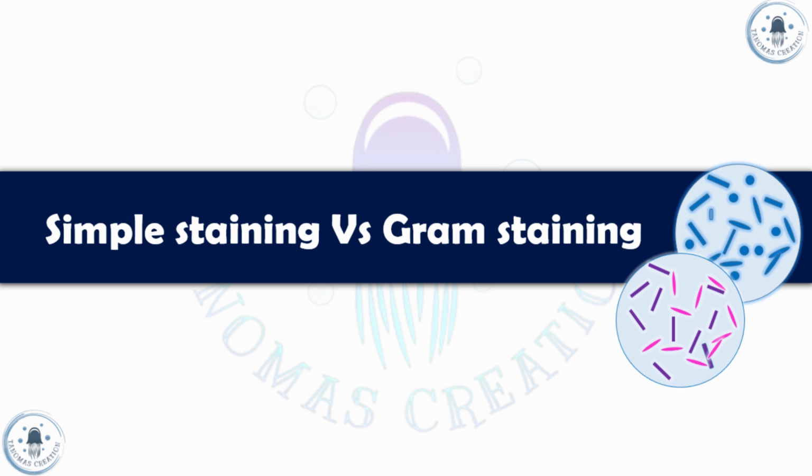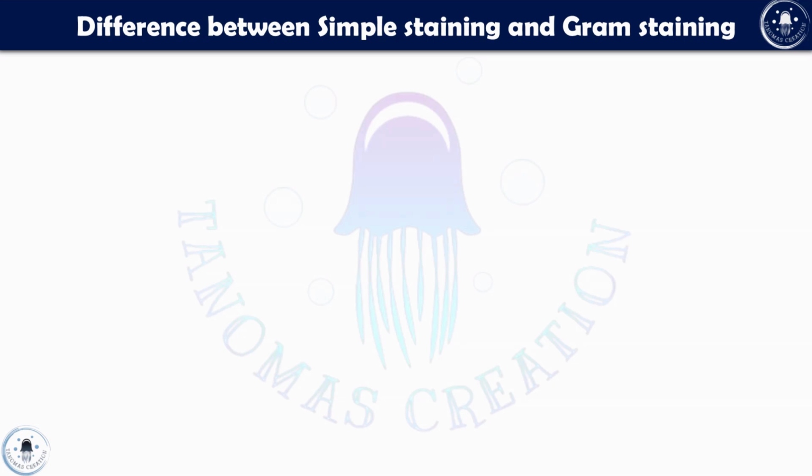Hello everyone. Today we are going to learn about the difference between simple staining and gram staining. Moving forward, coming to our first aspect of this differentiation, which is purpose. For which purpose do we actually use simple staining and gram staining?